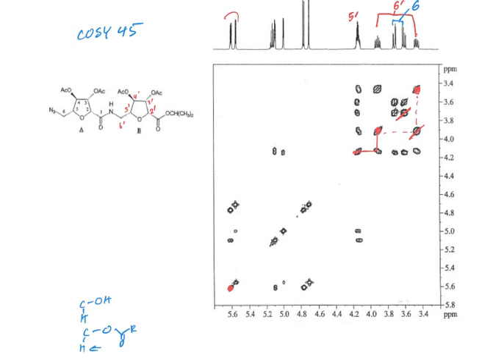Notice here that we're also, let's go to the other one too. So here's H6, and notice if we go to 6 and across, it also overlaps there. But if we look at these, notice that these two are slightly offset from these two. Okay?